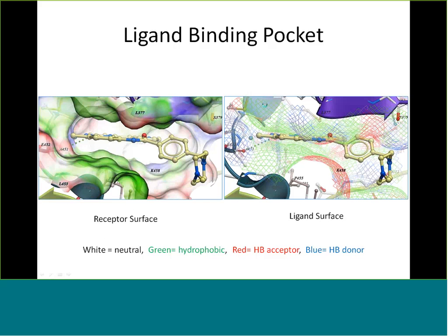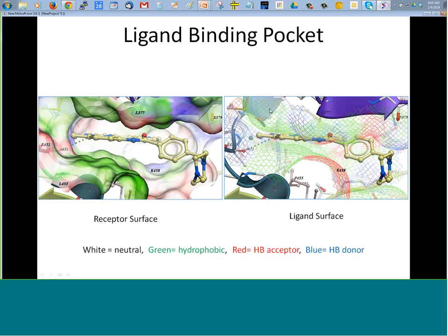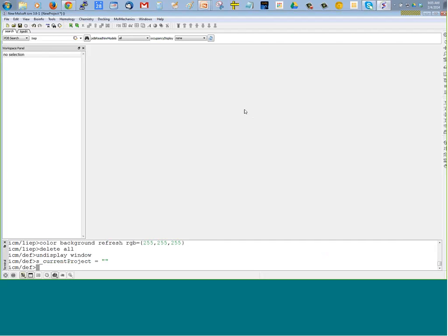So we'll go to the ICM. When you open ICM Browser, which is the free download, you'll see basically what I've got here, except for some of these menus, which are redundant for this webinar.